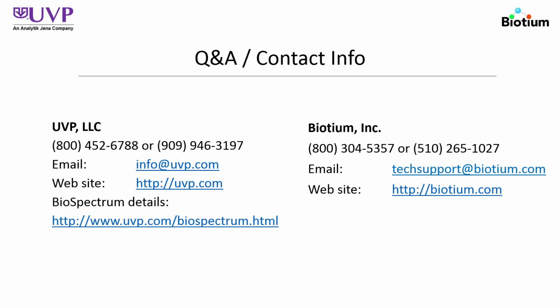Yeah, that's a great question. Frequently, researchers don't realize that they leave protein behind in their gel during blotting techniques, and it's important to get a complete transfer in order to get quantitative data. So once the protein blotting is complete, remove the gel from the membrane carefully, and then you can stain the gel to see if there's any remaining protein in the gel.